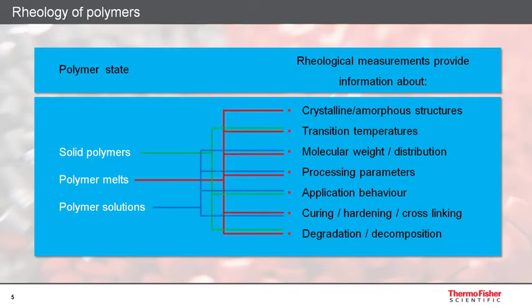As shown on this slide, depending on its state, rheological measurements can provide much information about a polymer.